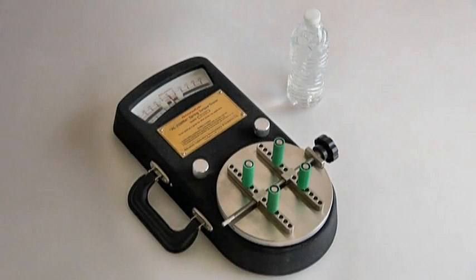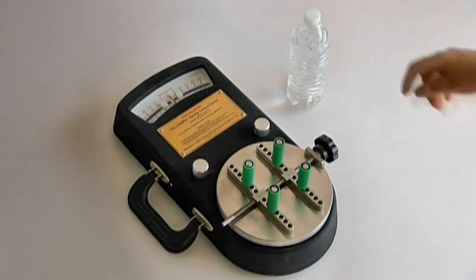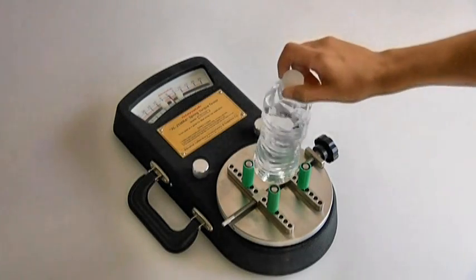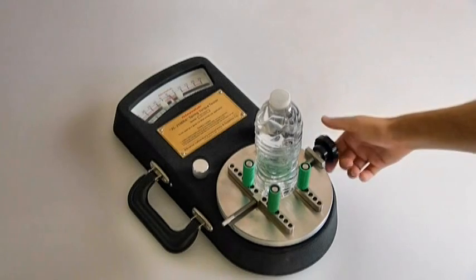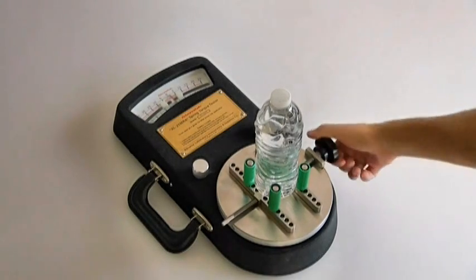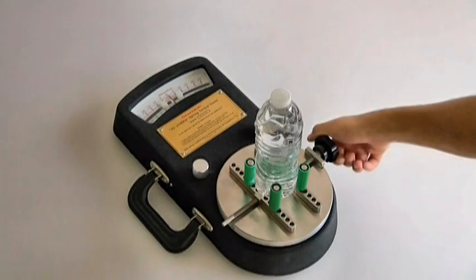The Advanced Lab torque tester measures the torque required to open or close a cap on a container. The container is placed on the platform and secured between the four bumpers. The white markers on the gauge are then set to zero.